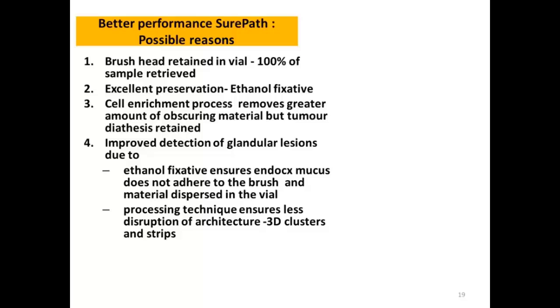Cell enrichment process by the density gradient removes a greater amount of obscuring material, although tumor diathesis is retained. That is in contrast to the filter used in ThinPrep, where tumor diathesis is also reduced to a large extent.